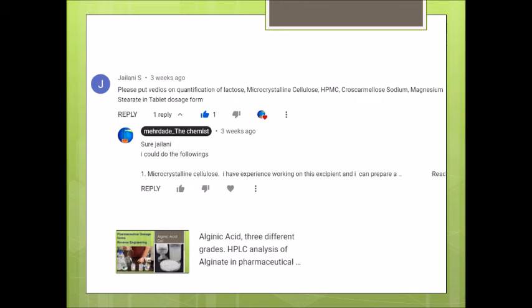So the choice of a column, maybe the Agilent column is not suitable for you. You use another column to retain the magnesium stearate a little longer, and I would say the separation would be rather straightforward, and I don't see much of an issue with the quantitation even using ELSD. Use a proper sample solvent so that you end up filtering out the HPMCs, the cellulose and stuff, so that you will have less interference.